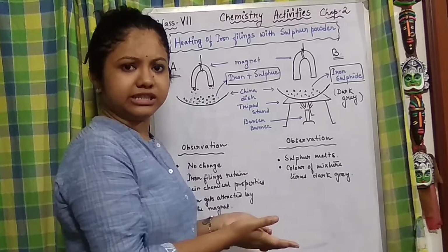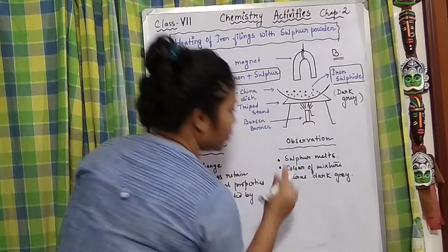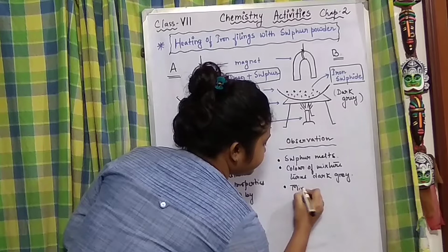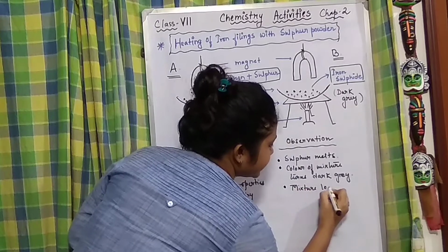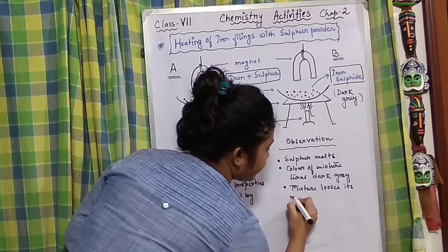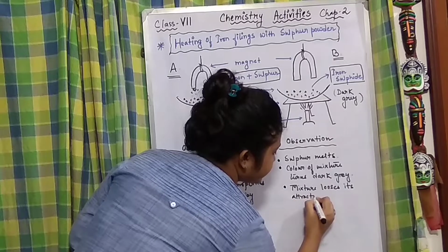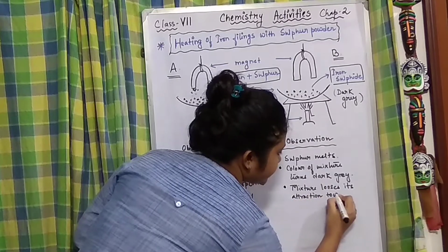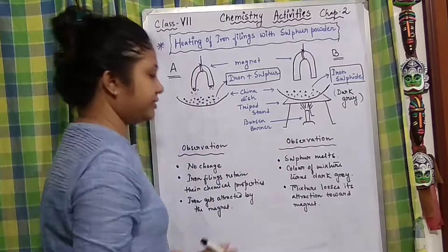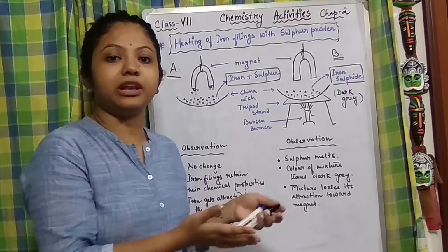So we are going to write it down, observation: the mixture loses its attraction toward the magnet, right?